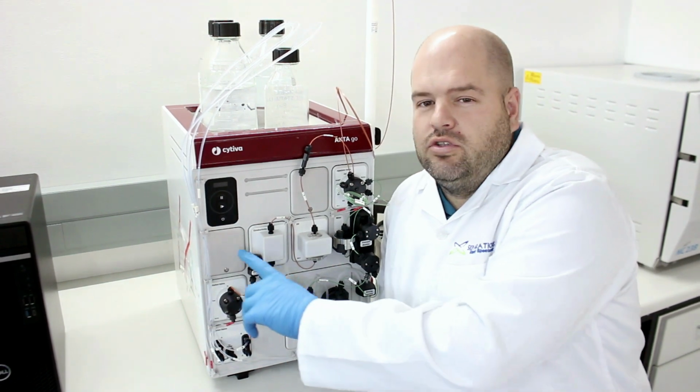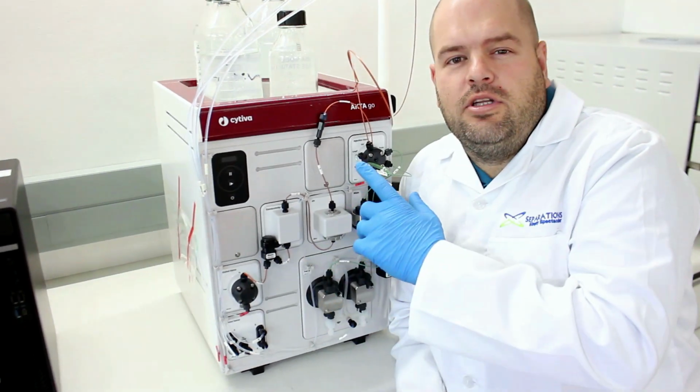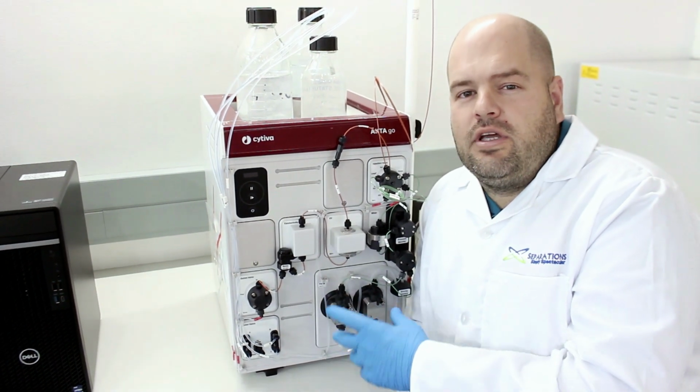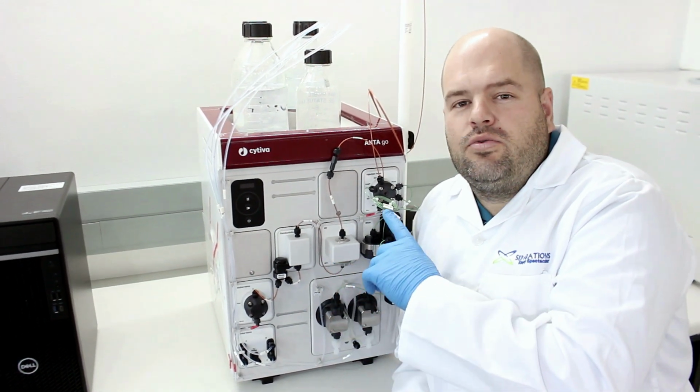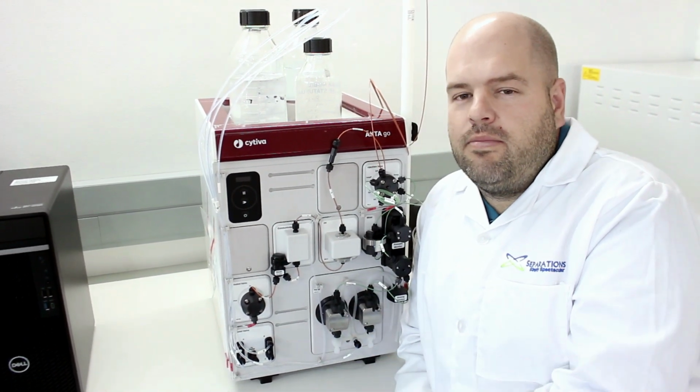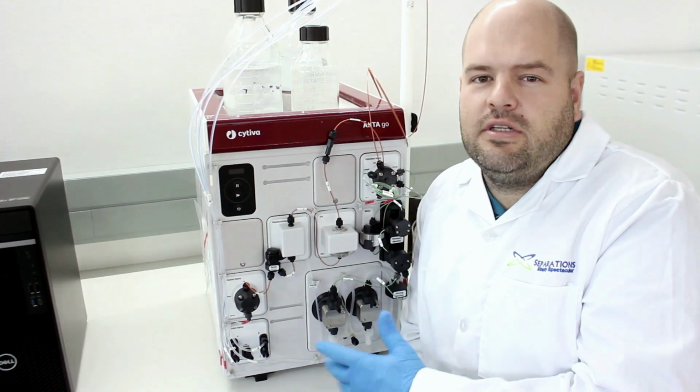We can also install a pH meter, which will monitor the pH of the eluent as the runs go on. Finally, we can install air sensors, which will allow you to monitor if there's any air ingress into the system, which might compromise your results down the line.